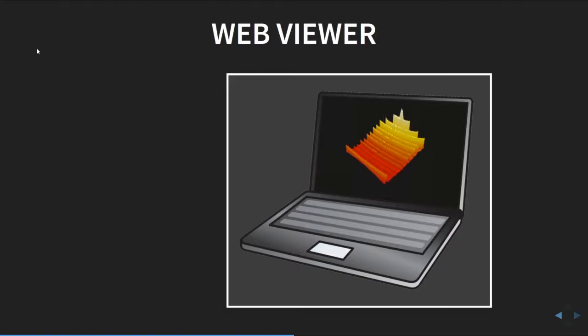services, we want to have a couple of tools that are simple and easy to use for people to get a quick look at their data. One of these was to make a simple viewer, and we thought doing it in a web interface would be handy.